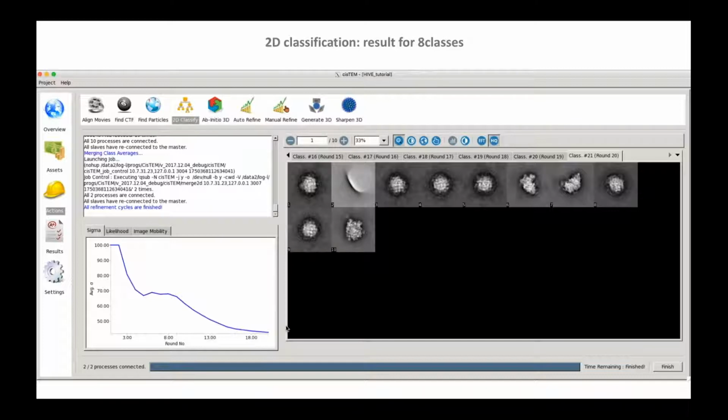If you have an orientation like this, and you have 1,000 particles in there, one particle will be like that, another will be like this, another third will be like this, and you're averaging all of that. So you're losing a little bit of information. So how do you set the binning boundaries for something like this? There's a structure, there's one like this, there's one like this, but there are some similarities between the structures, and those are each binned into separate particles.